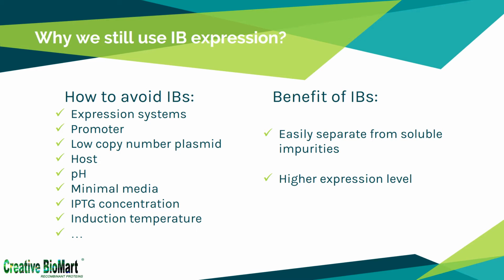Besides, there is a special benefit for IB production, because the IB can be easily separated from large amounts of soluble impurities in the culture by washing and centrifugation. The expression level in IB is usually much higher than in a soluble system. Therefore, IB expression is still widely used in biopharmaceutical production. The development of an efficient refolding process is thus very important for increasing productivity.